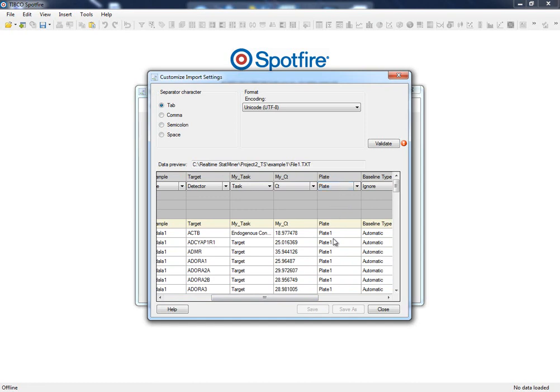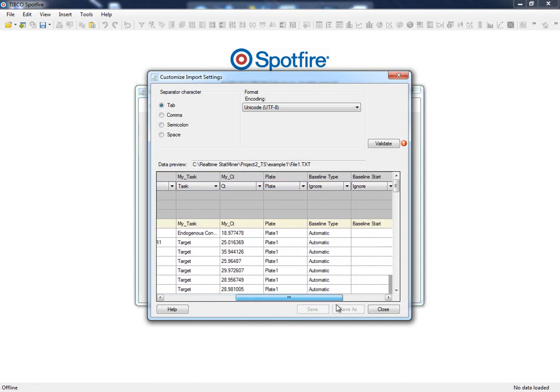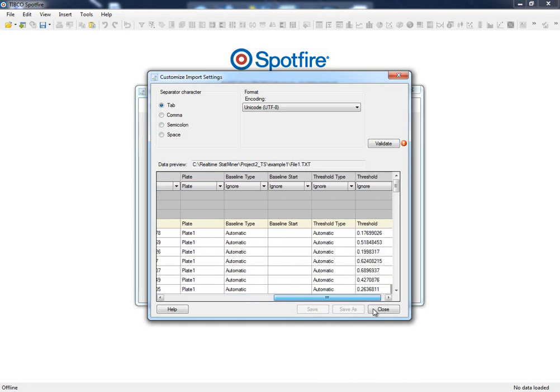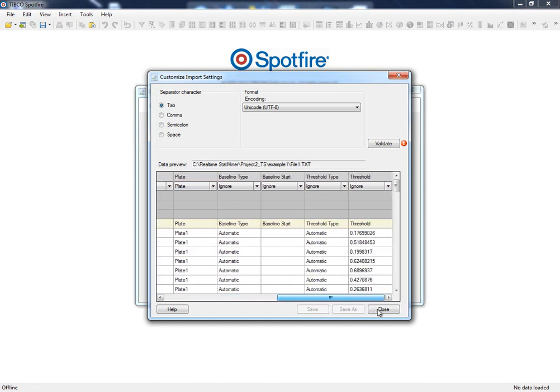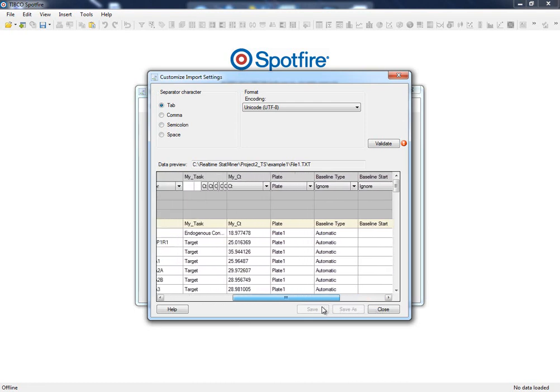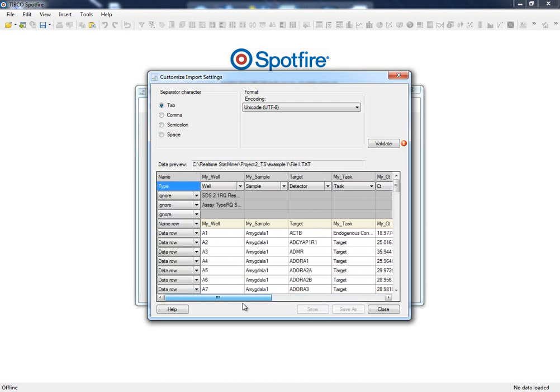In this case, we don't have any information about the efficiency of the reaction, so we are ready to load our data. The rest of the information will be ignored in our analysis.